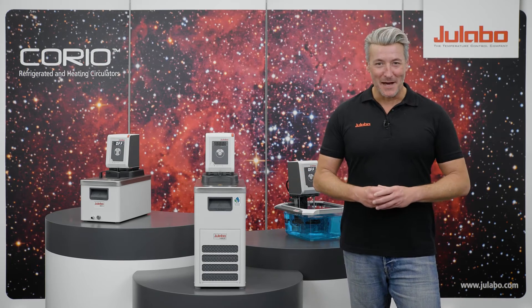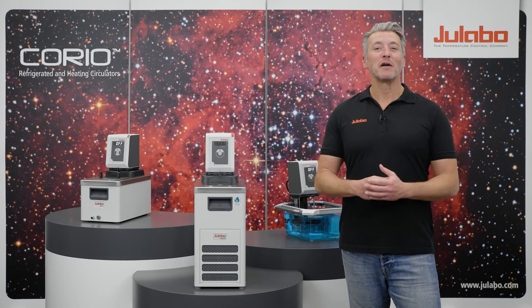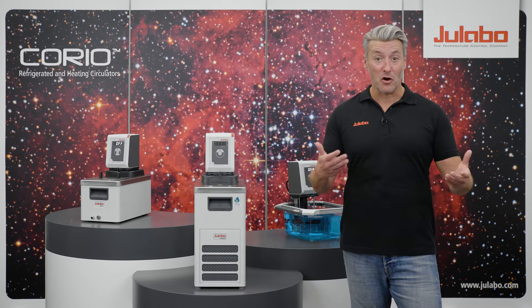Hello and welcome to uLabo. My name is Alex and today I will show you the basic settings of your Corio circulators. With just three keypads and an easy-to-read display, anyone can start using it right away.